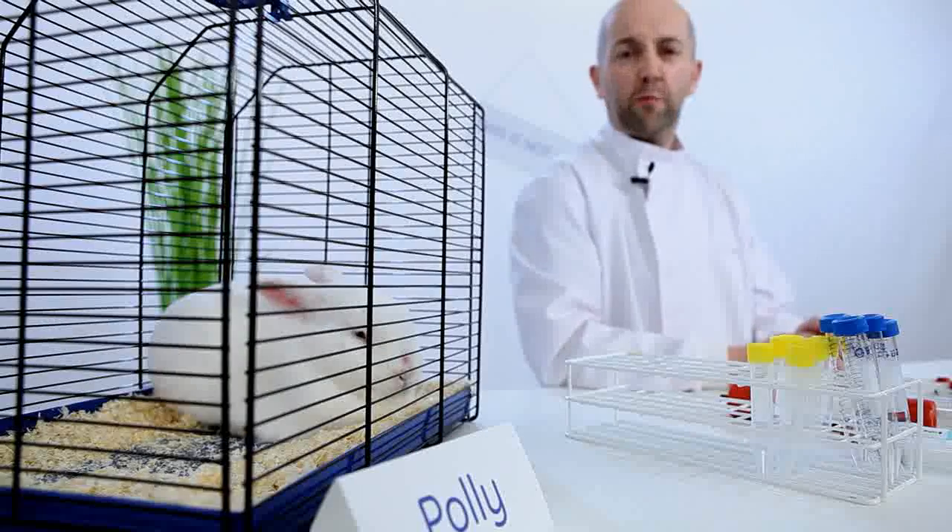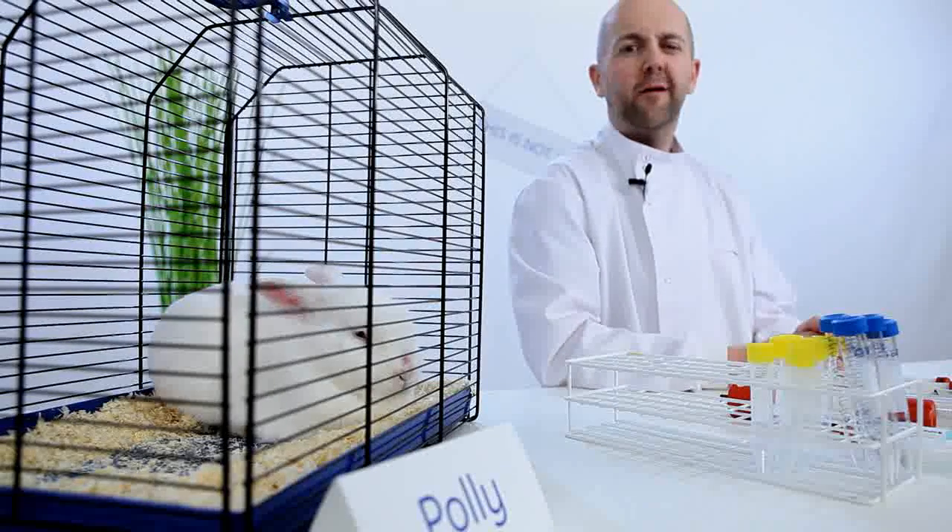Avoid the problem by collecting your antibody into tubes containing 1 molar Tris-HCl at pH 9. The final pH of your eluted antibody will then be around neutral, and your precious antibody will be safe. Alternatively, neutralize the pH with buffer exchange immediately after elution using pre-packed Sephadex columns.